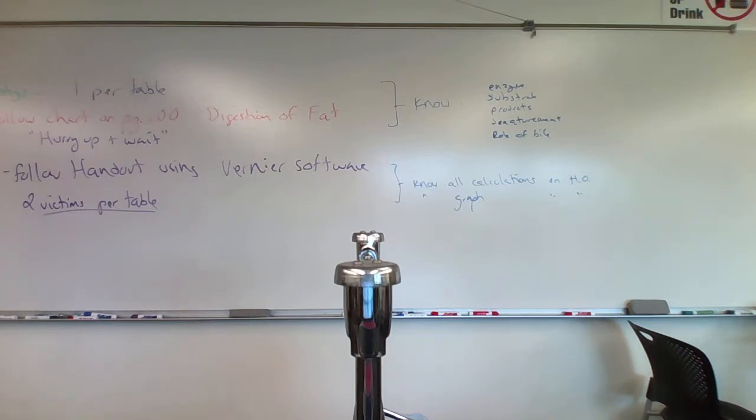So you're going to do 5 drops of this, 5 drops of the water, and then you're going to incubate it at 37 degrees C, which is this little bubble bath right here. It should be at 38. You put them in here because it's body temperature, so we're simulating your body. That sits for an hour, and all of these will be incubating for an hour. So the sooner you get them all in the bath, the sooner your life will move on.